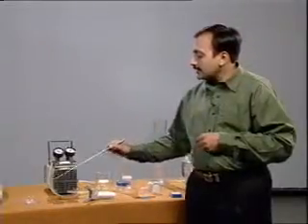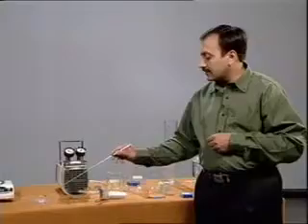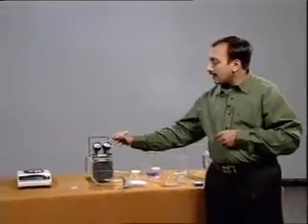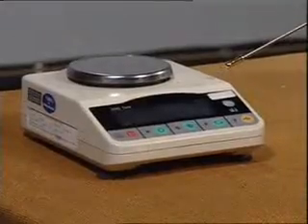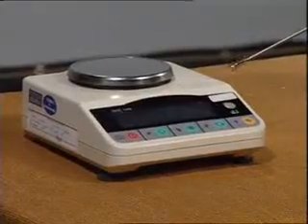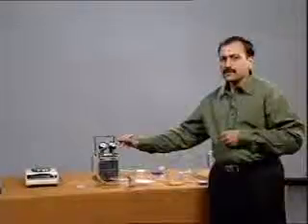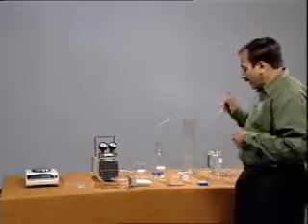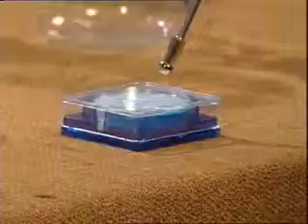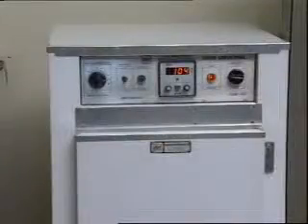We also need a porcelain or borosilicate dish to place the filter, an electronic balance of capacity 150 to 200 gram and accuracy of 0.001 gram. The filter paper of pore size 1.2 micron is used, and a drying oven.